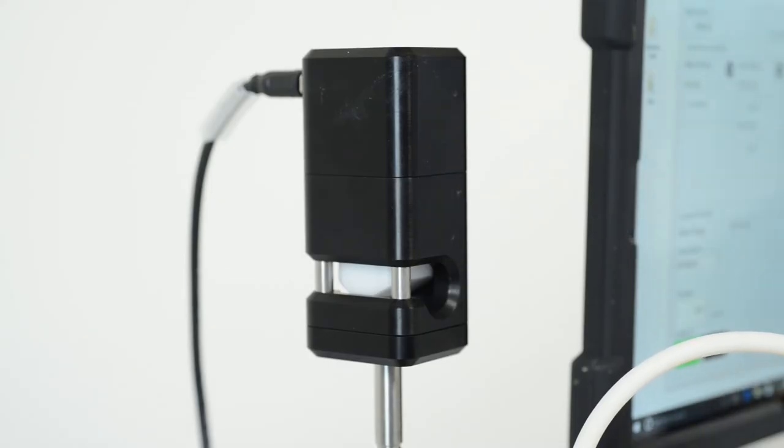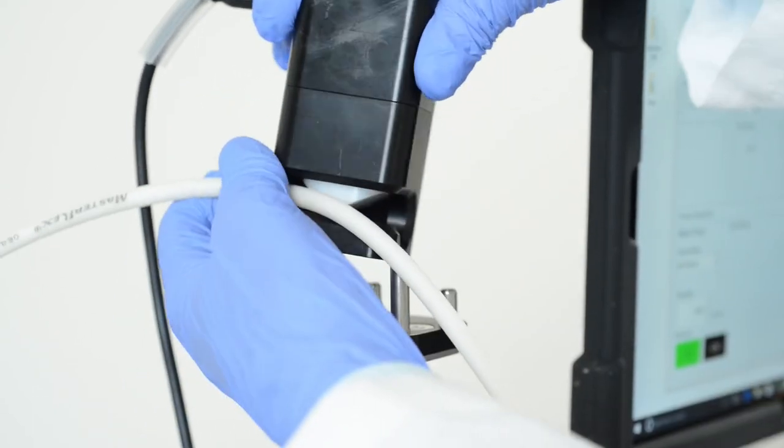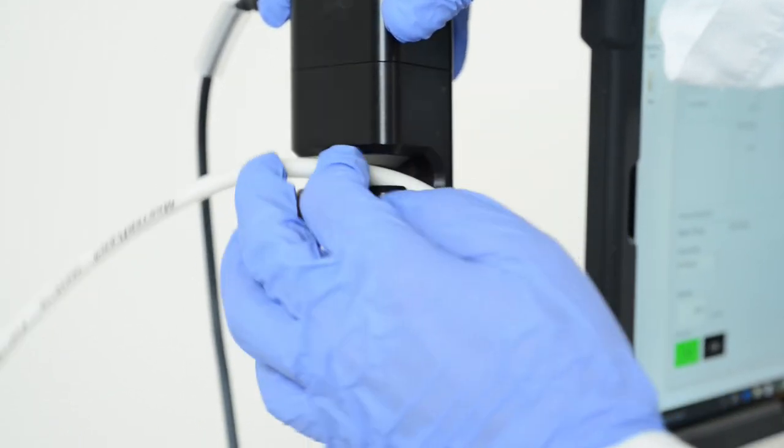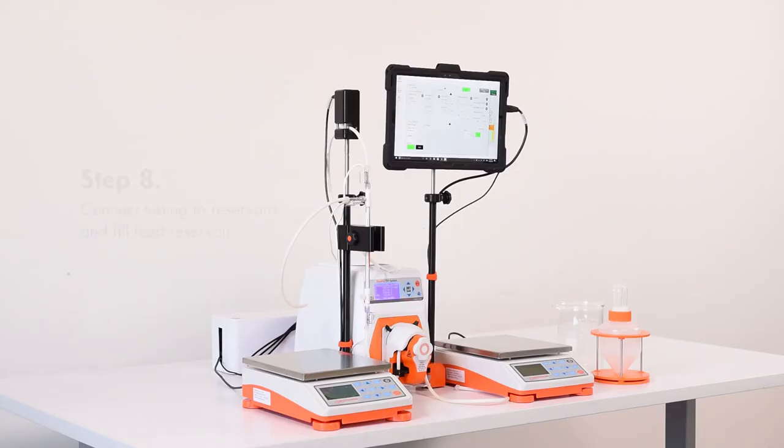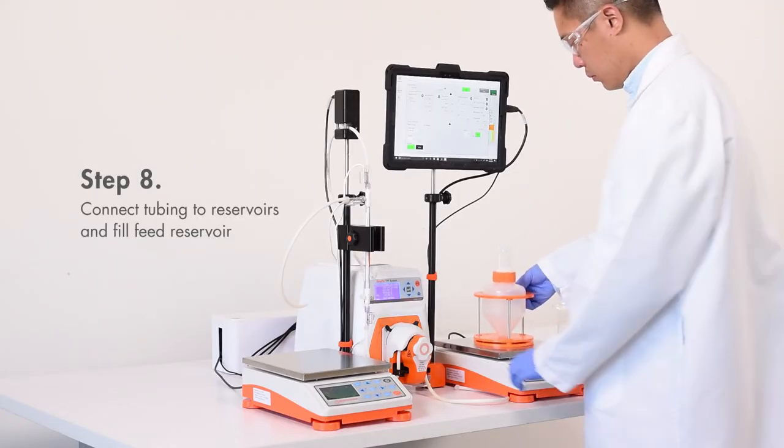Feed the retentate tubing through the automatic back pressure valve if required. Connect the tubing to the reservoirs and tare the feed scale.